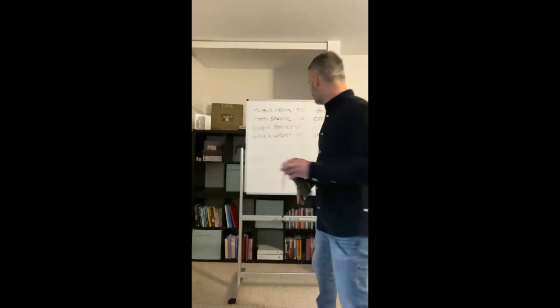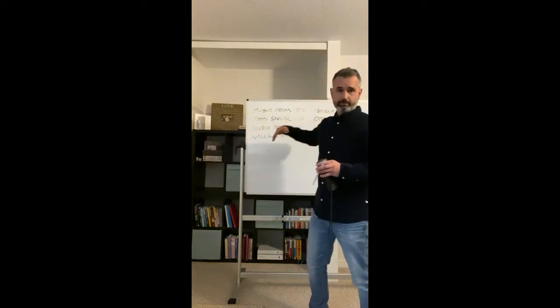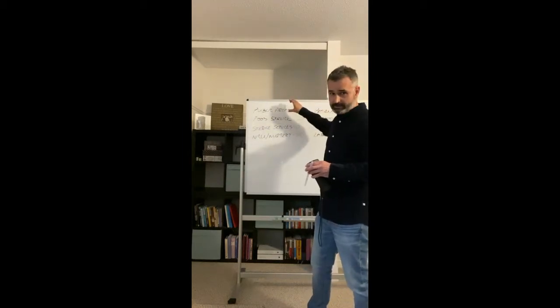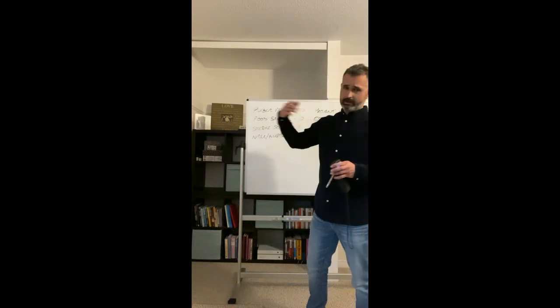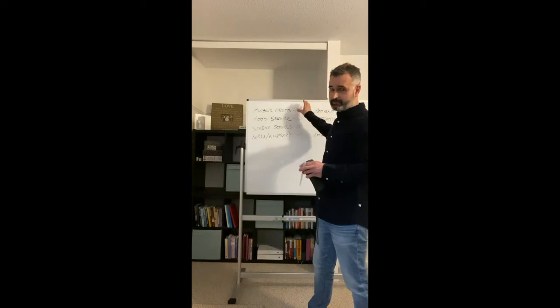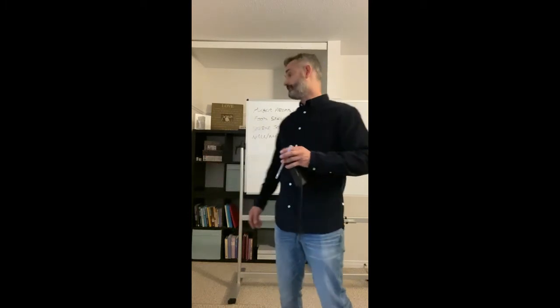What I mean by that is, let's just say we take a hospital environment. So if we give the public space, which obviously is quite a bit harder to control than, say, an ICU operating room, that would actually get a 50, would be an acceptable number. Now, that's not a pass as far as the disinfection goes, but again, it's an uncontrolled environment, so we wouldn't expect that to be continually passing as a disinfected area.